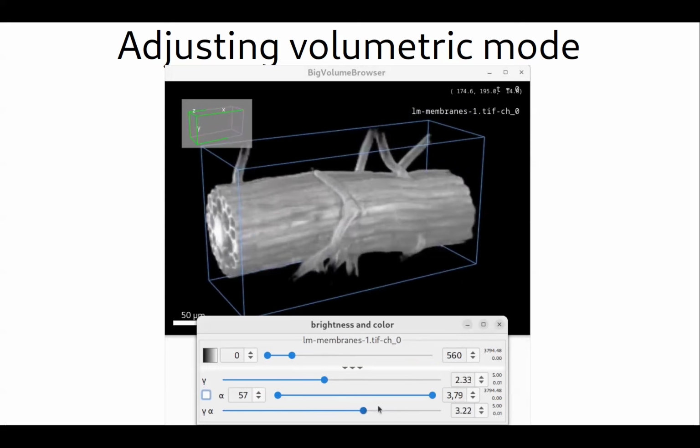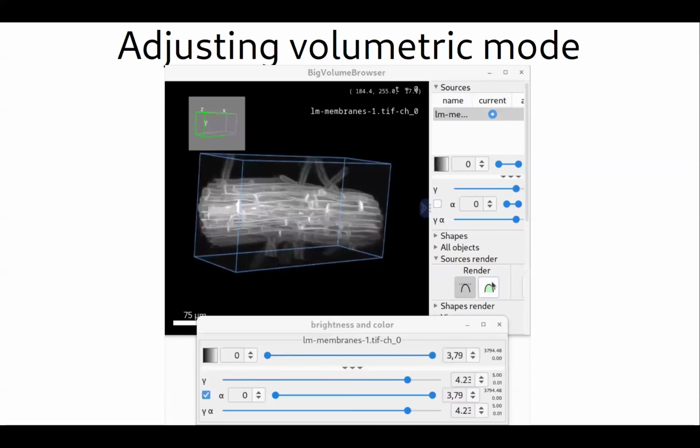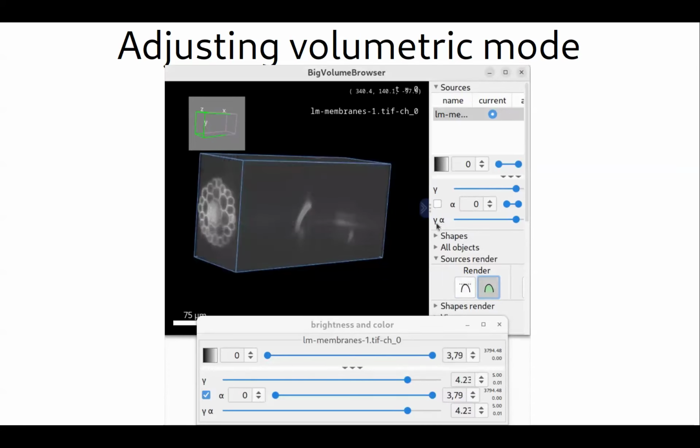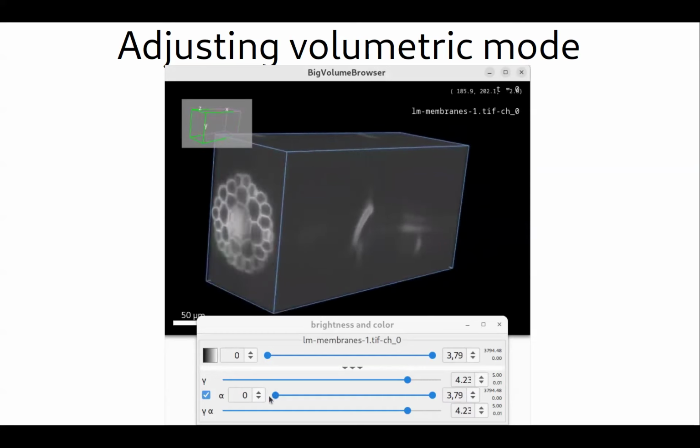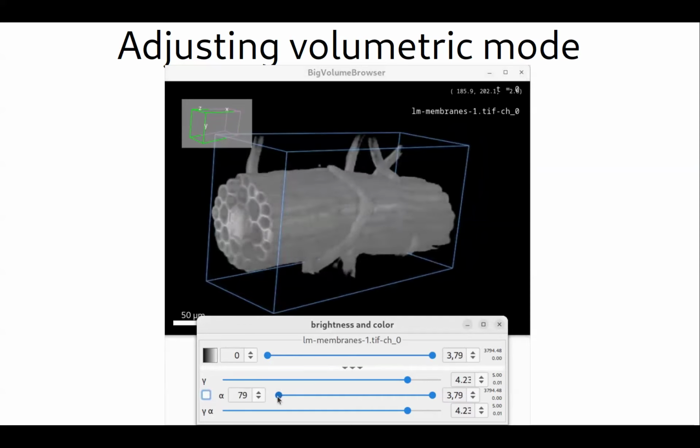But as with anything in this life, in the end, the final result depends on the person. So now you get a general idea of how to work with these things, and there is no right or wrong here. Everything is just a representation of the data that you already have with specific mappings, so you can find settings that work best for you.